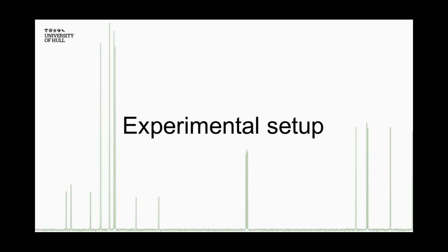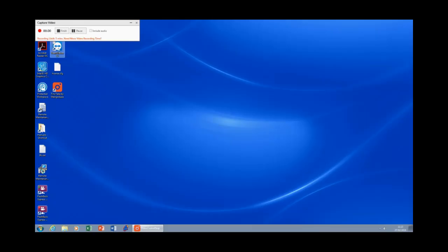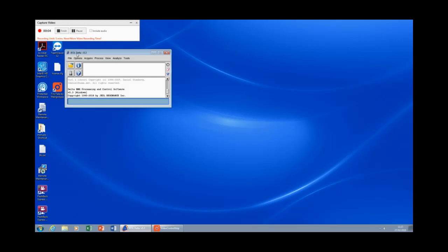This will only work if the correct probe has been inserted. Contact a technician if you have any questions on how to do this, and please do not attempt to swap the probe yourself. Once we know the correct probe is in the NMR machine, we need to switch modes. For all basic NMR experiments, the walk-up mode is used.